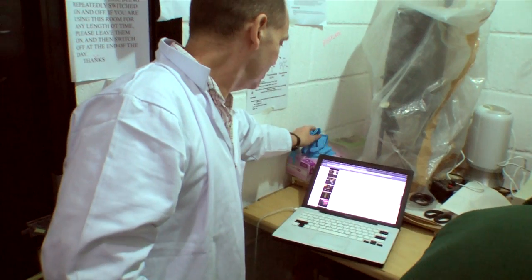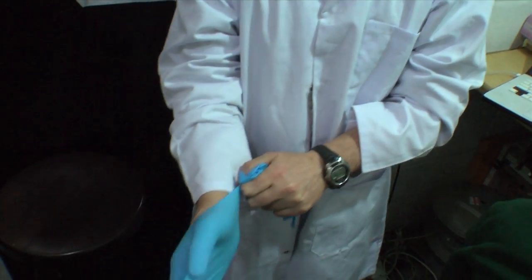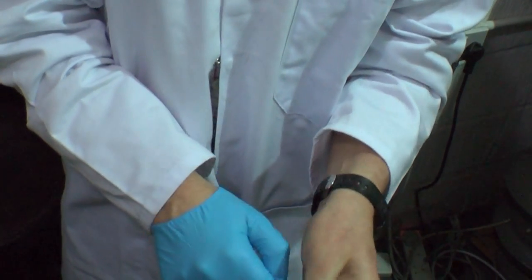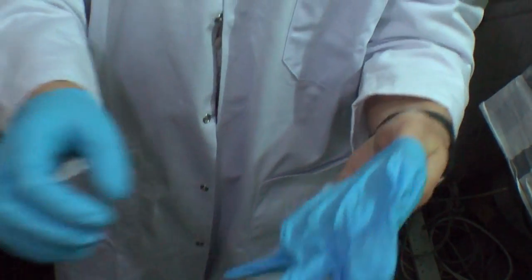I put on gloves. Is it a sort of talisman that means nothing? If we want to actually get a license, we have to do certain things. One of the things is for certain procedures we have to wear lab coats, and for some procedures we have to wear gloves. So I think it's quite good to get into best practice now, even though it's probably just a talisman, probably just ritual. As an anthropologist, you'd like that kind of thing.